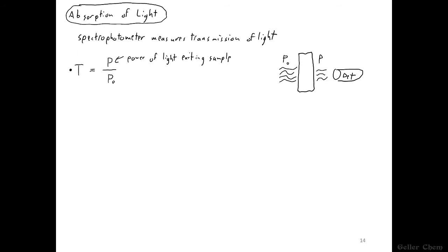And the units for power in this context are a little bit different than what we learned in electrochemistry. Instead of just joules per second, it's actually joules per second times cm squared. So we have this area term in there. And so really what these units are describing is how much energy is reaching a given area of a sample per second. And energy is the most important part because energy is related to light.